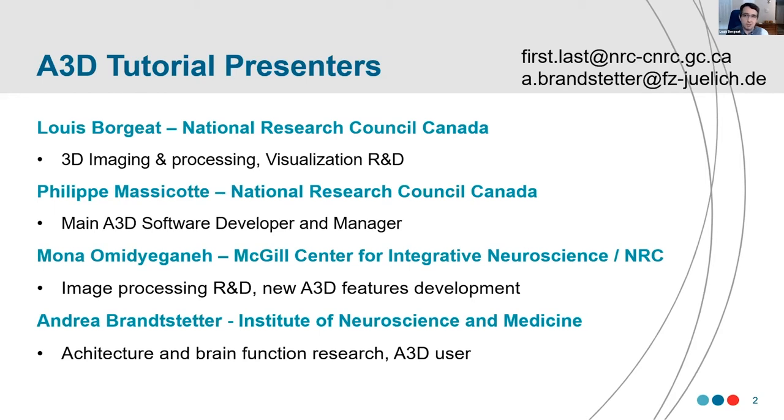She's also involved in developing new features within A3D and will be describing her use case. And we also have Andrea Brandtstetter from the Institute of Neuroscience and Medicine, who will be providing more of a user perspective on A3D, as most of the other presenters are more on the computer science side of things.